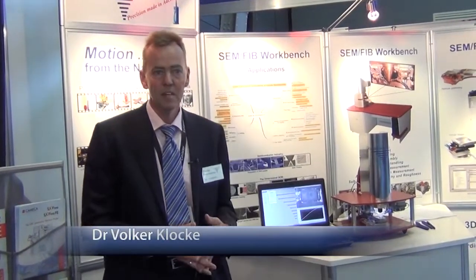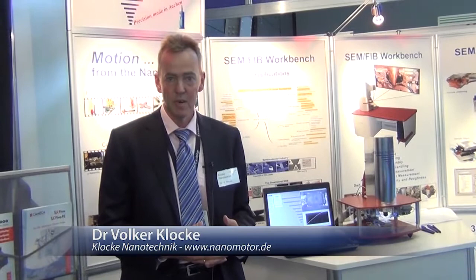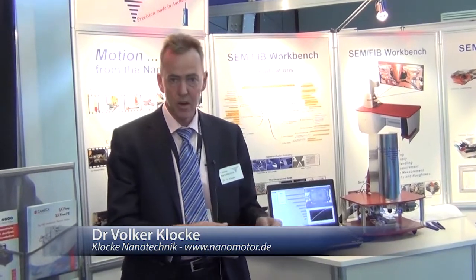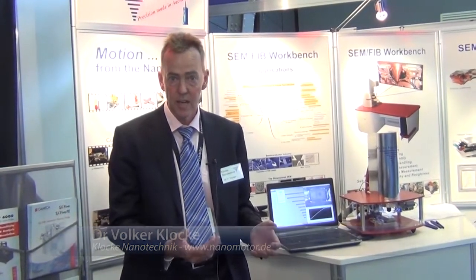We developed a new system that's easier to describe when I make a comparison with light microscopes. With light microscopes, you are used to take your hands and operate quite complex things in a very easy way.